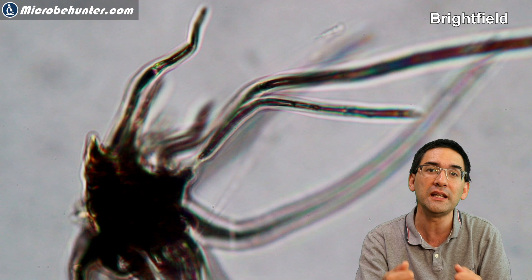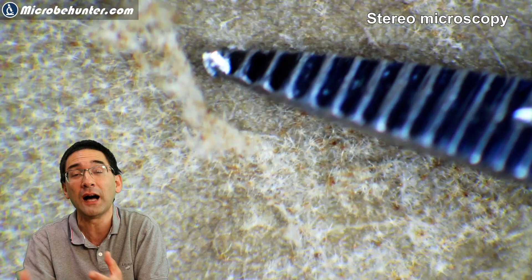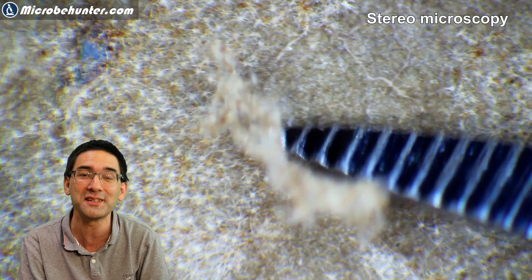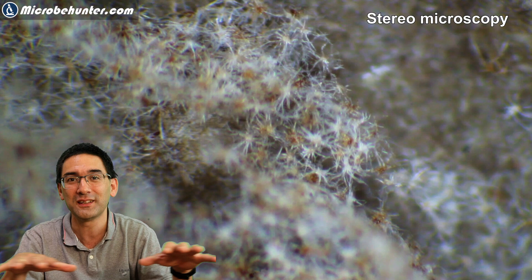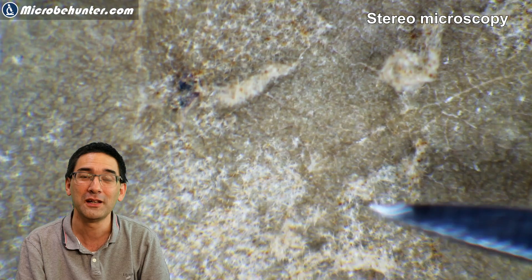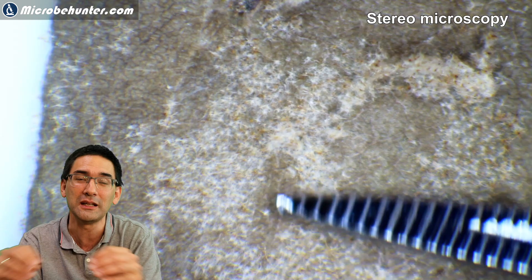Trichomes are outgrowths of the surface layer of a cell — the so-called epidermis — but they themselves often don't contain any living material. I wouldn't say they're dead as such, but they are simply outgrowths without living matter. Here you can see me collecting the fuzzy trichome material using my stereo microscope and small tweezers; I then harvested the fuzz, made a specimen slide, and observed it under my compound microscope.